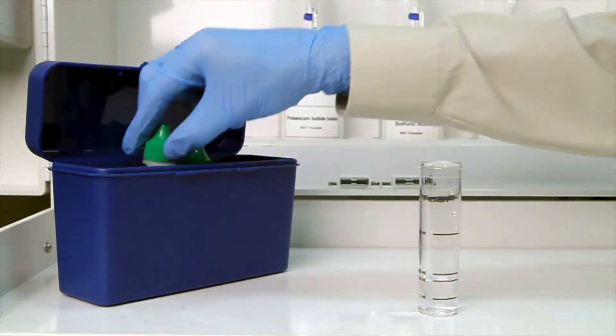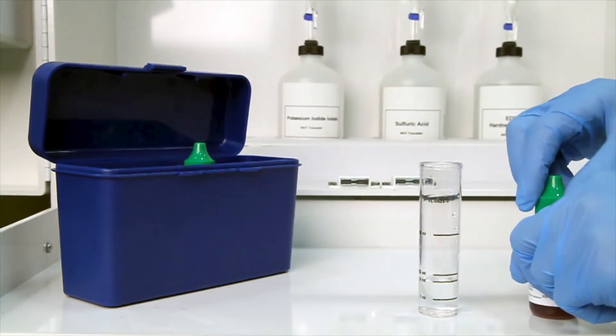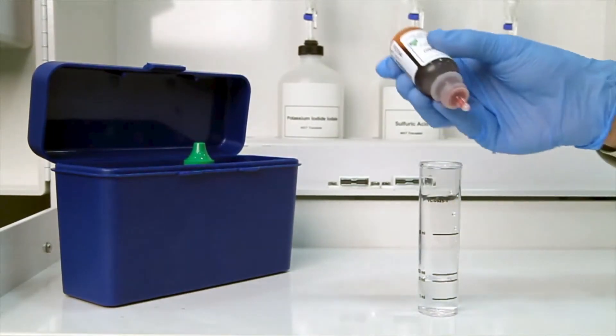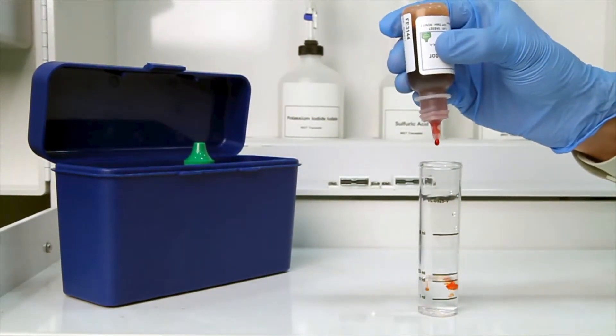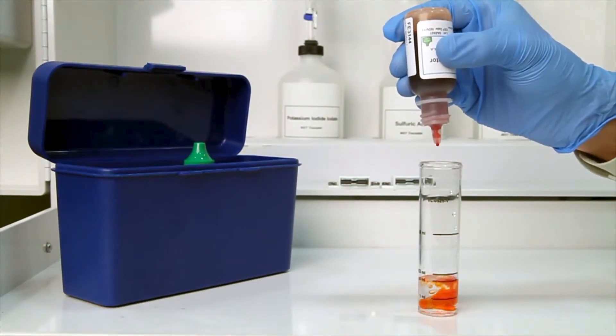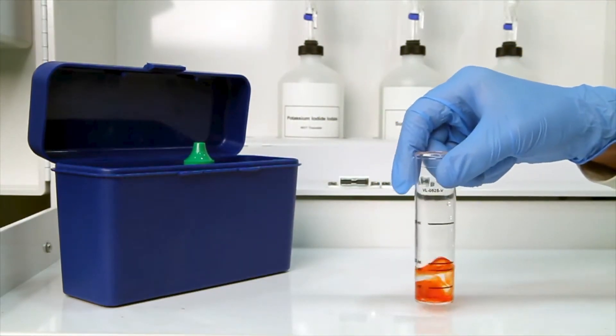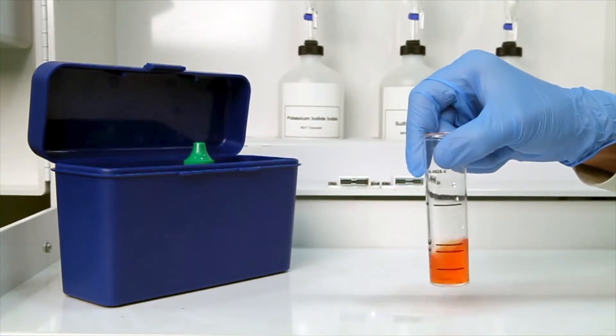Once you have collected an accurate sample, the next step is to add eight drops of ferroin indicator. The bottle contains a dropper tip, so it's important to hold the bottle vertically to get a consistent drop size. After the addition of each reagent, it's important to swirl the vial to make sure the reagents are properly mixed. The sample should turn orange.